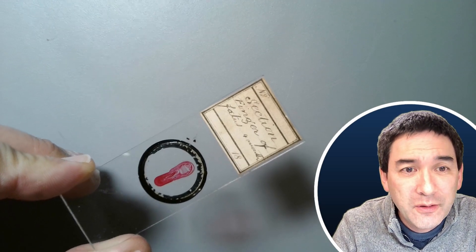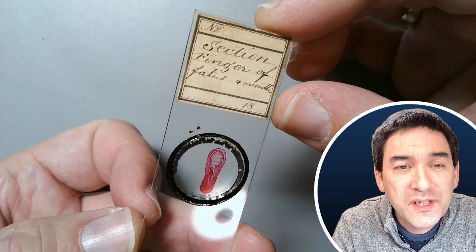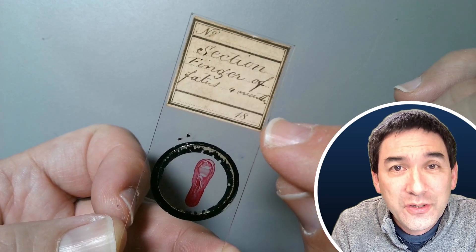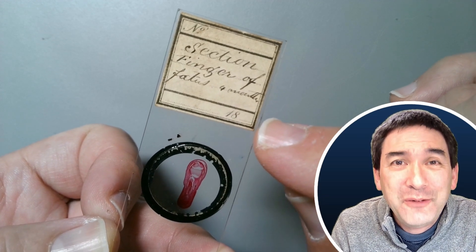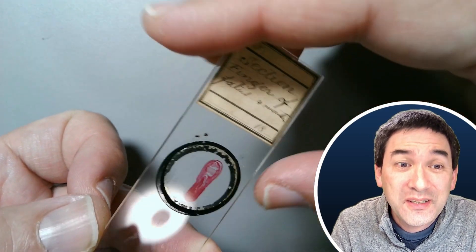Let me focus this a little bit. As you can see on the slide label, it says 'section finger of fetus four months,' and there is the number 18 printed in the lower right-hand corner. I think that space was for the date or year. It's not filled out, but it shows the slide label must be from the 1800s — so it's an antique microscope slide.